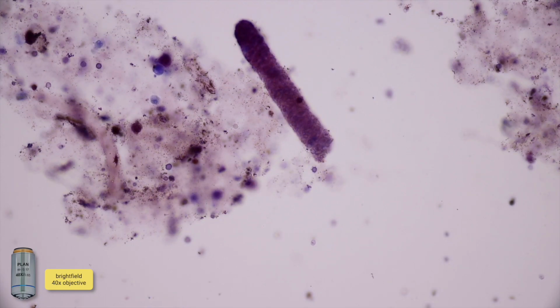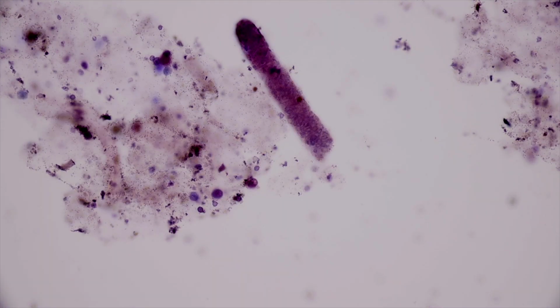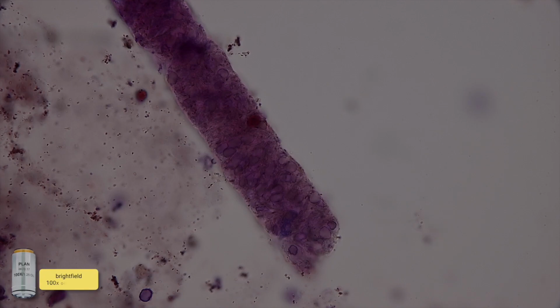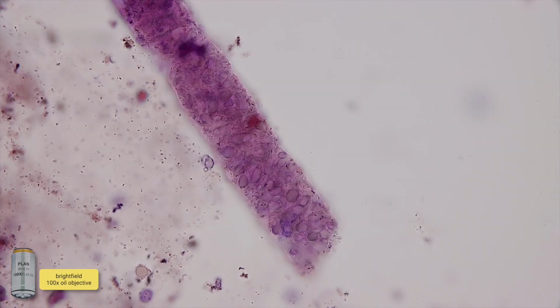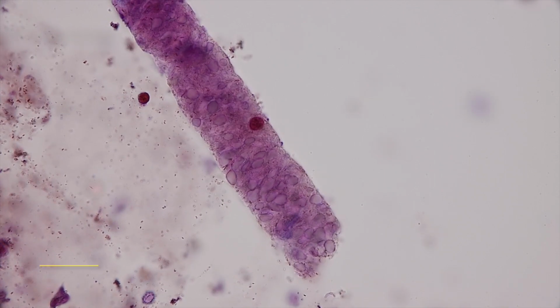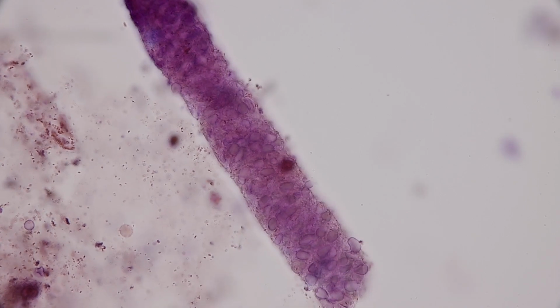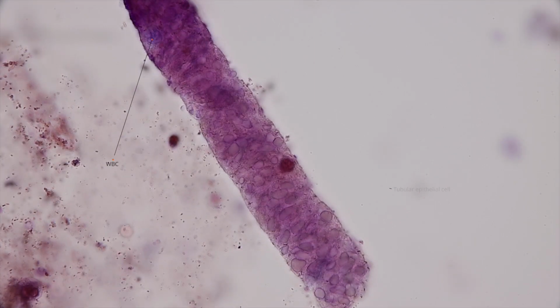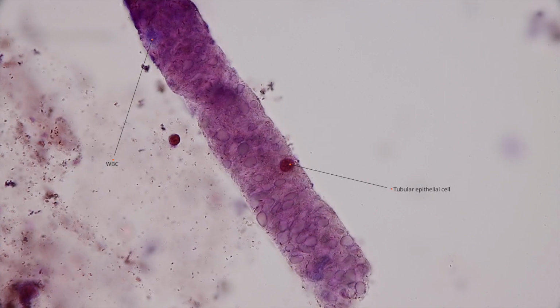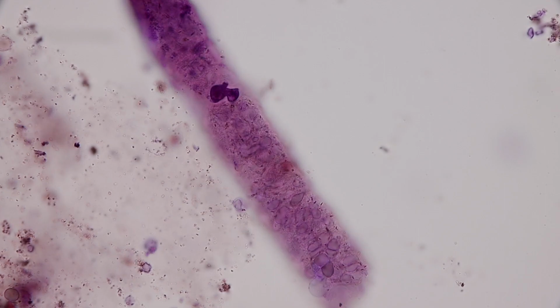And focusing up and down, we can tell that there are cells within this cast. They look like red blood cells, but we can't quite tell what else might be there. So we'll go up to the 100x oil objective, looking a little closer. Focusing up and down, we see red blood cells. These are very fresh red blood cells without much sign of degeneration. Focusing up and down, we see a couple other cells, a white blood cell at the top with a segmented nucleus and a tubular cell with a large eccentric nucleus.